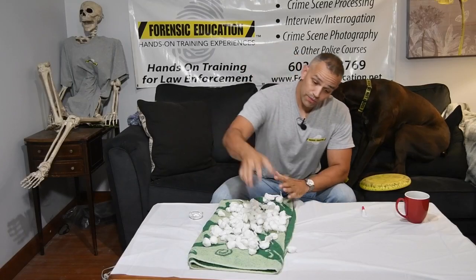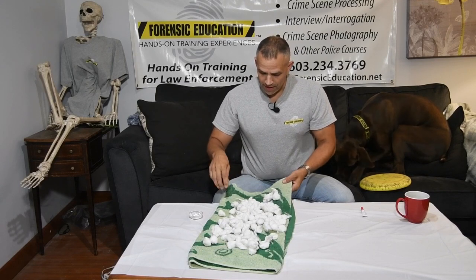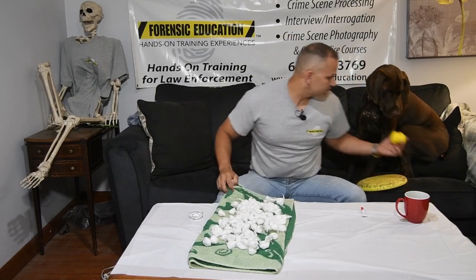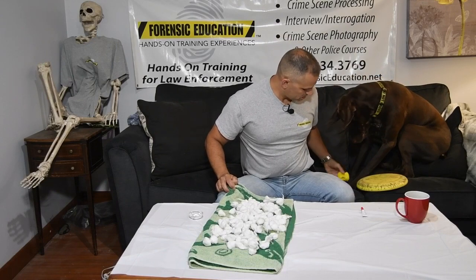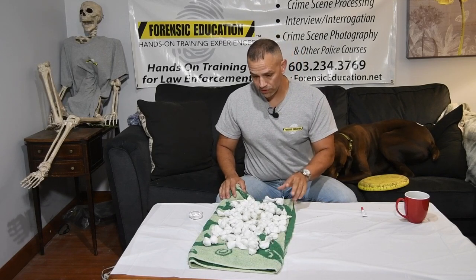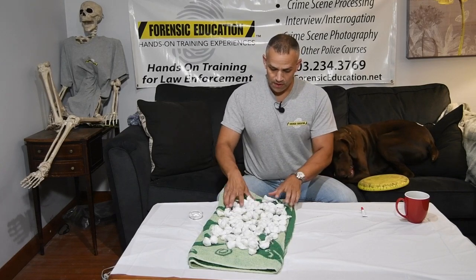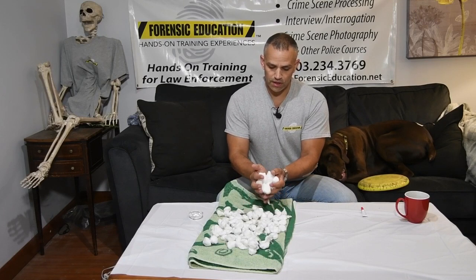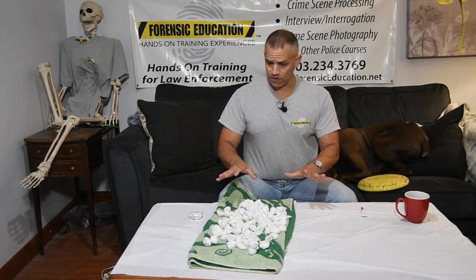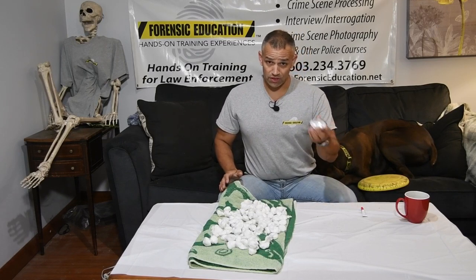Alright everyone, now we've dried these out. I did change the towel again, so that's two towels changed. These have been drying for two full days and they're still just a little bit damp, so I wouldn't put them in a zip-lock bag yet. But you can gather them up and put them in a paper bag. Once they're completely dry, then you put them in a zip-lock bag and they work great.